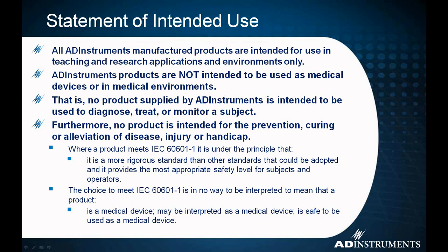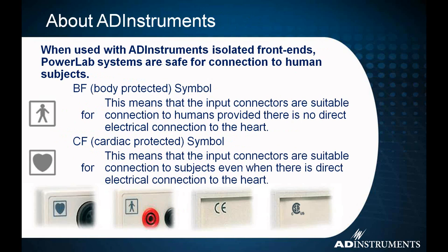These next couple of slides are things we added due to some questions we get fairly commonly from customers. You definitely don't have to read all of this. Basically, the takeaway message is that our products are not intended to be used as medical devices or in medical environments. For research, yes, but do not use them to try to diagnose, treat, or monitor an actual subject.